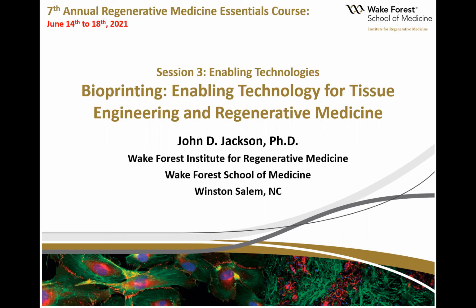Good afternoon. I would like to thank the organizers for giving me the opportunity to present to you today an overview of bioprinting. During the talk, I will describe the many types of bioprinting techniques that are available, as well as give you examples of how we're using bioprinting in our research projects.